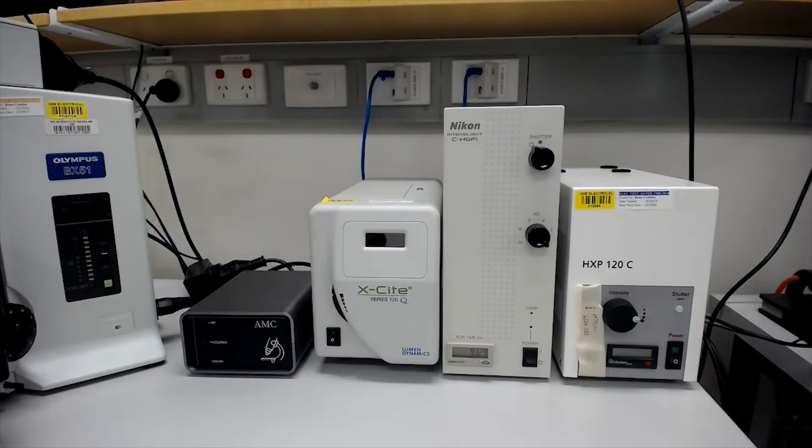Throughout the facility, you will see one of three types of epifluorescent lamps: the Excite, the Intensilite, and the HXP. Operation of all three lamps is very similar, as they contain high-intensity discharge lamps with lamp hour and temperature monitoring.